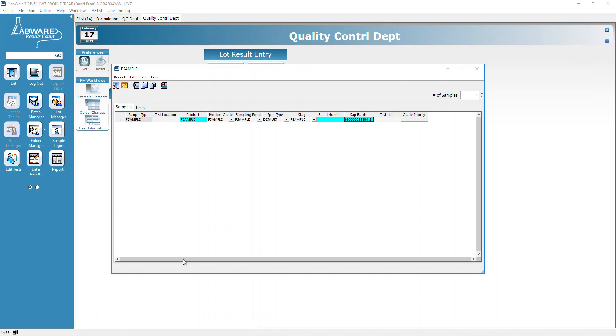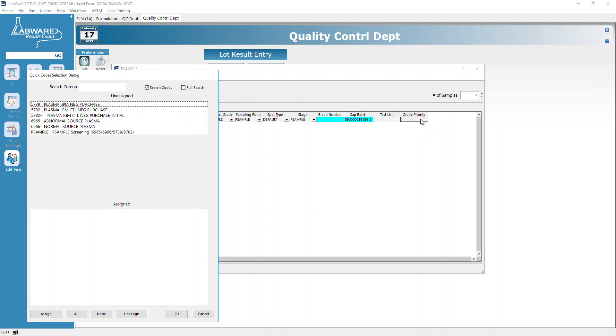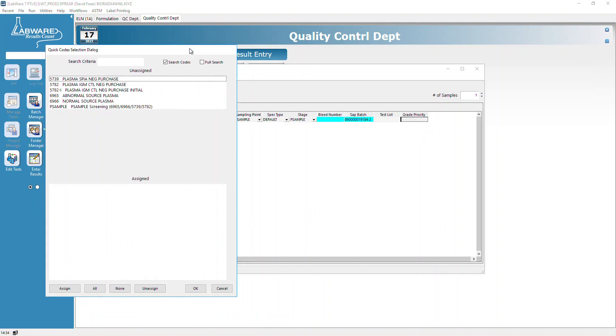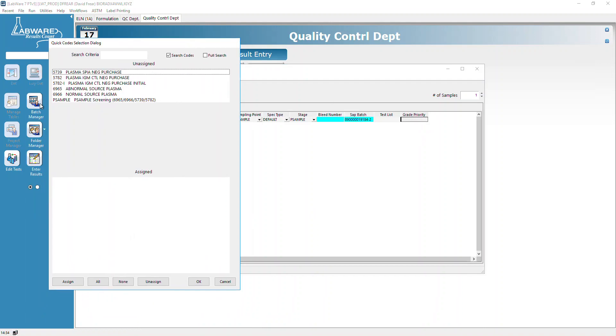Now we're going to set the grade. I clicked on the grade priority, and now we can select which product we want to grade.